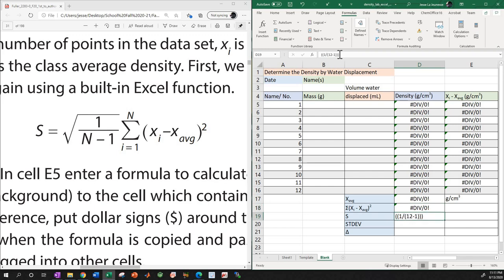Okay. So we're going to multiply. Multiply is, you could either use parenthesis, star means multiply also. And that's one term, so I'm going to give it its own sets of parentheses. D18. All right. Close parenthesis. Terminate.